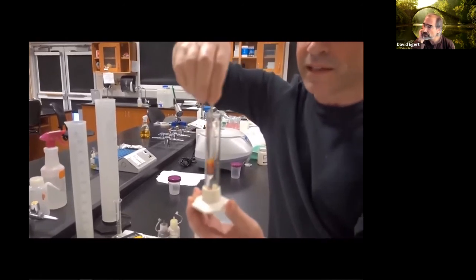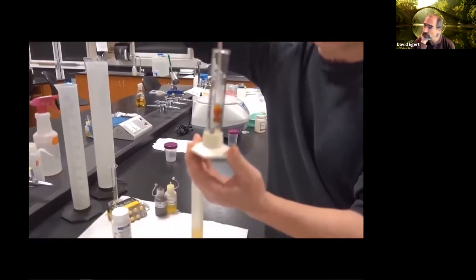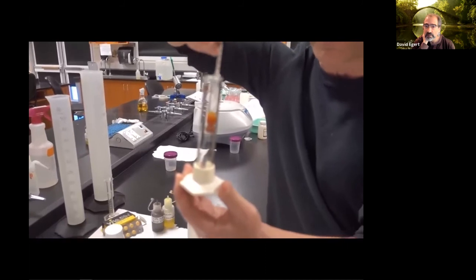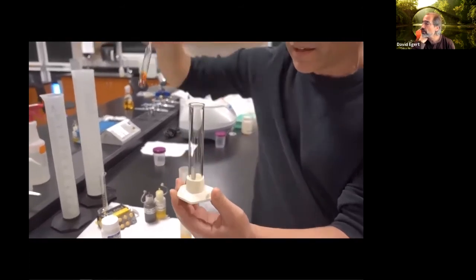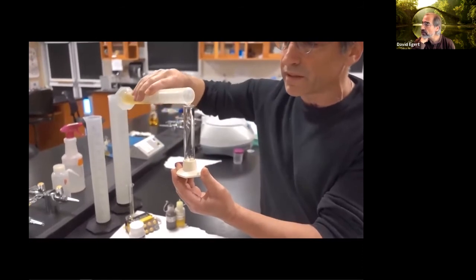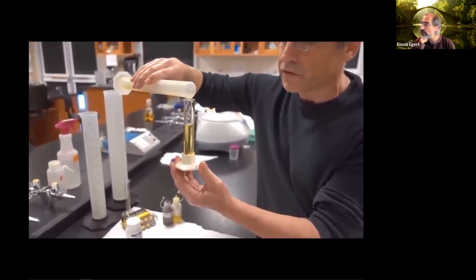It's the same idea. Depending on the density of the urine, this little float will float further up or sink further down, and the level of the urine on this little scale is going to tell us the specific gravity. Typically you add about 2/3 of the height of the tube.